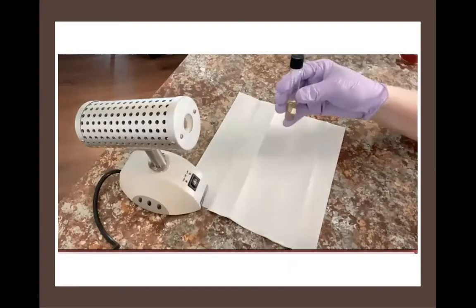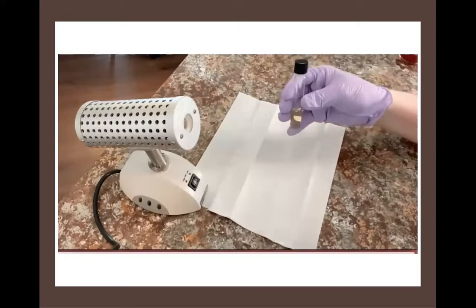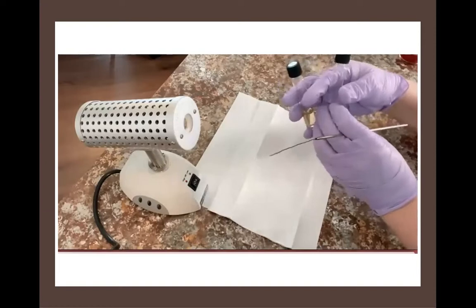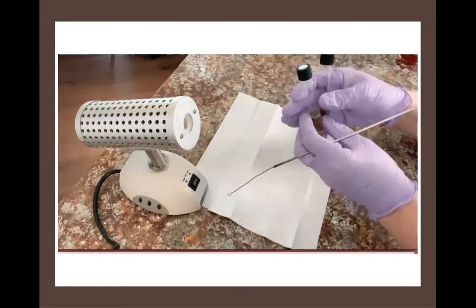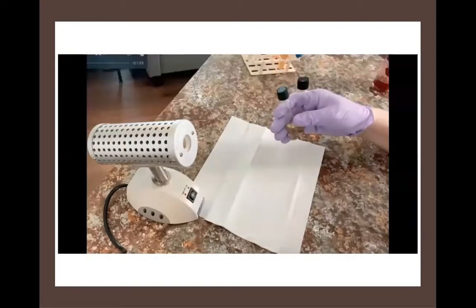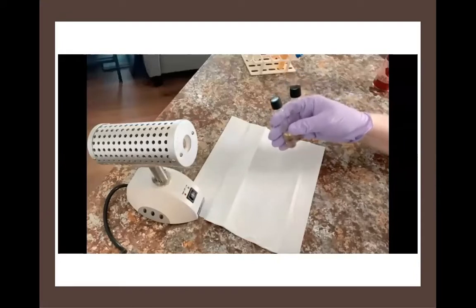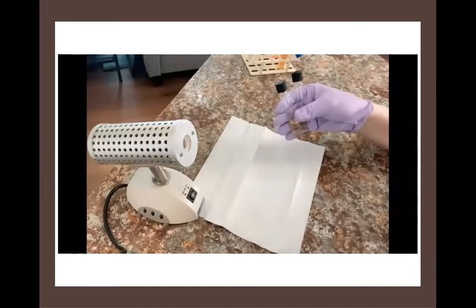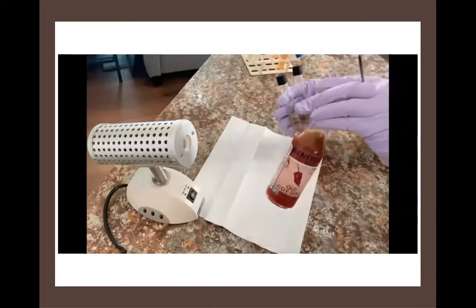This tube has my bacterial culture in it, okay? And this tube has clean nutrient broth in it. Notice that I put the clean broth tube up higher in my hand. I'm going to widen our view here a little bit. Now, the other thing I'm going to need is a Bunsen burner. And of course, I don't have one. So I'm going to substitute in my bottle of hot sauce.